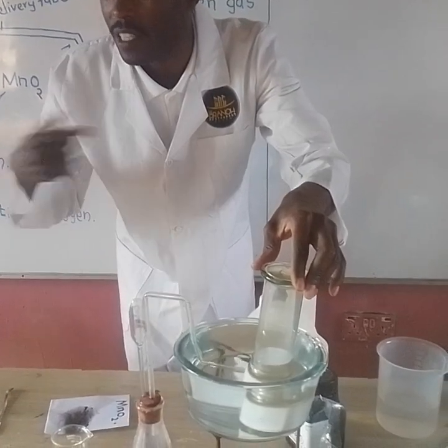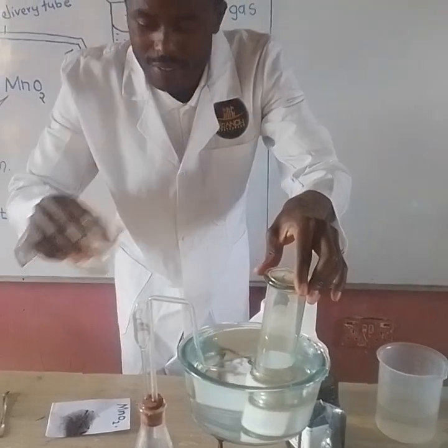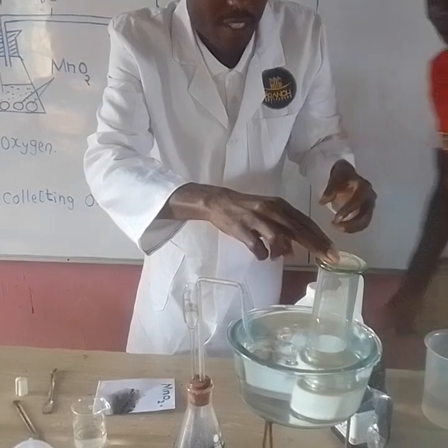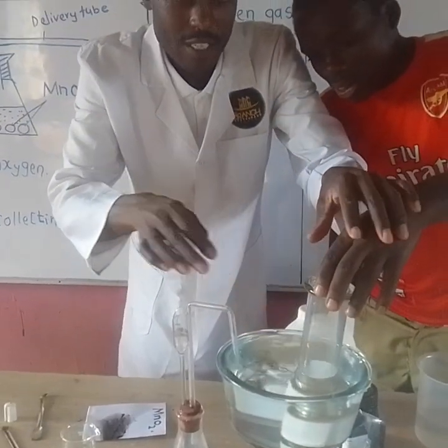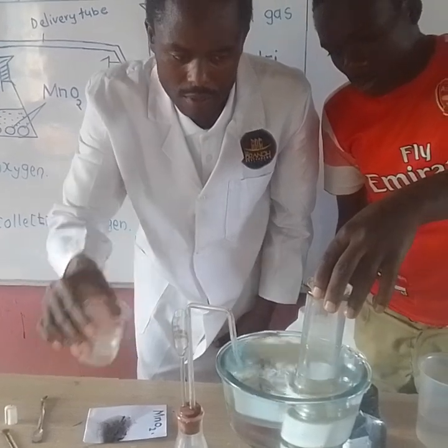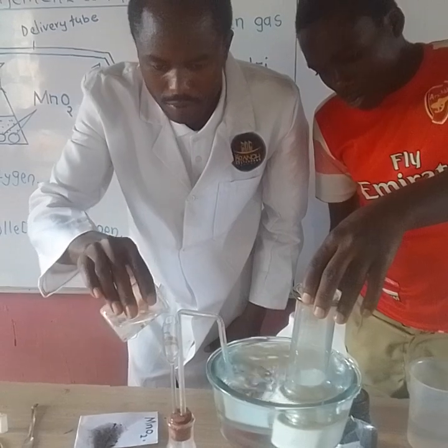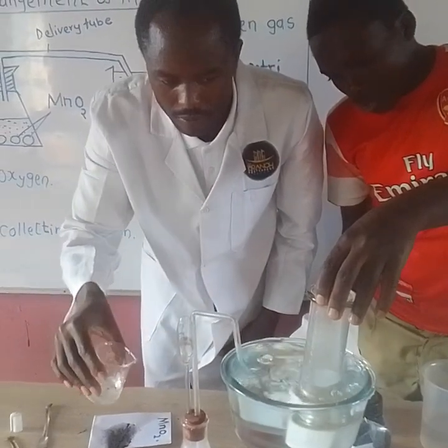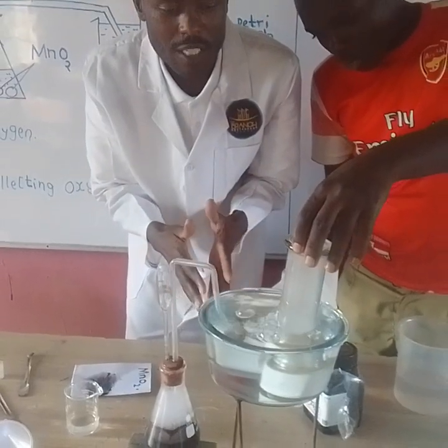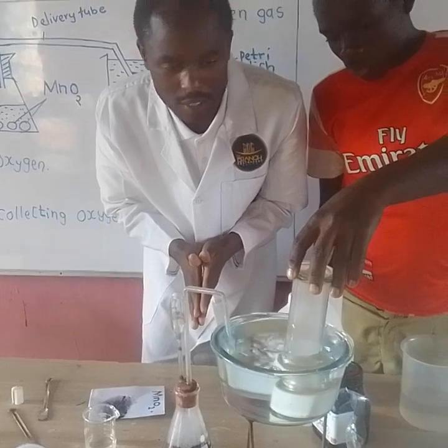My student Emmanuel, please come around and help me to do this. Just come this way. Just help me to get hold of this slightly like that. It is okay. Thank you. My student, as Emmanuel is holding this, you can see the bubbles, very many gas bubbles. Is it okay?